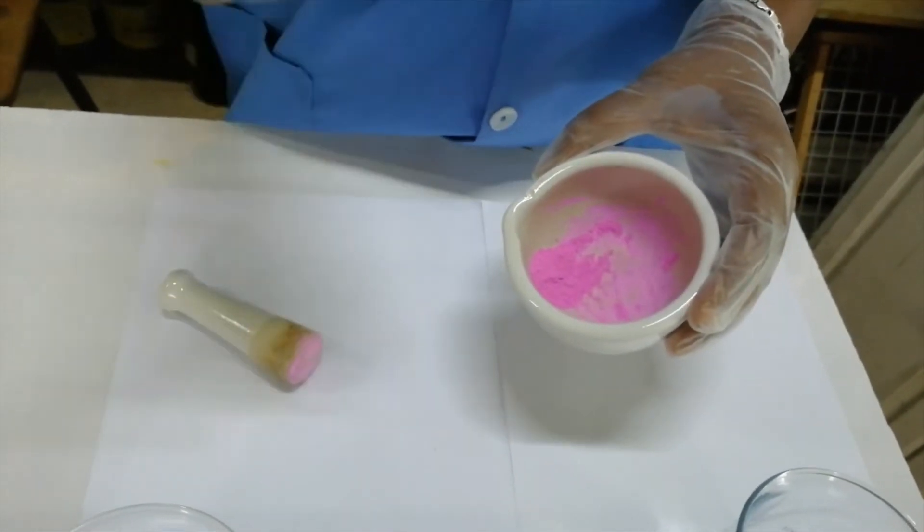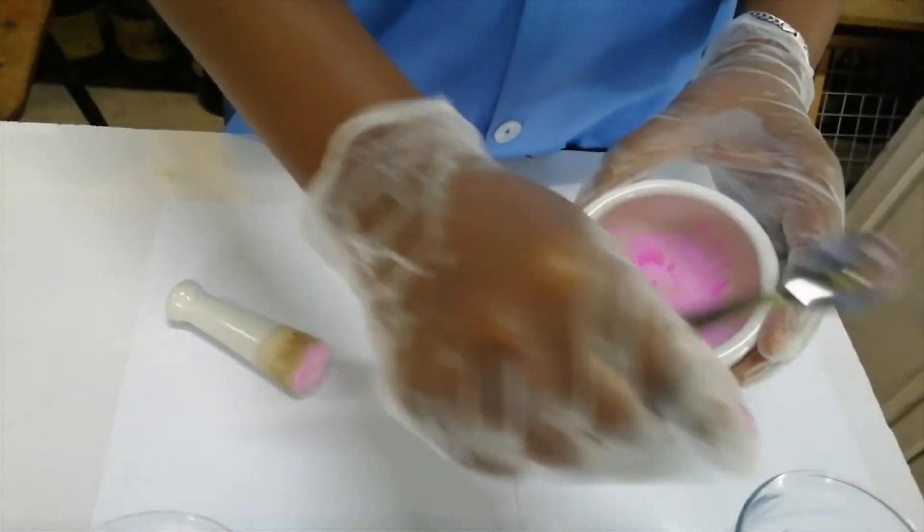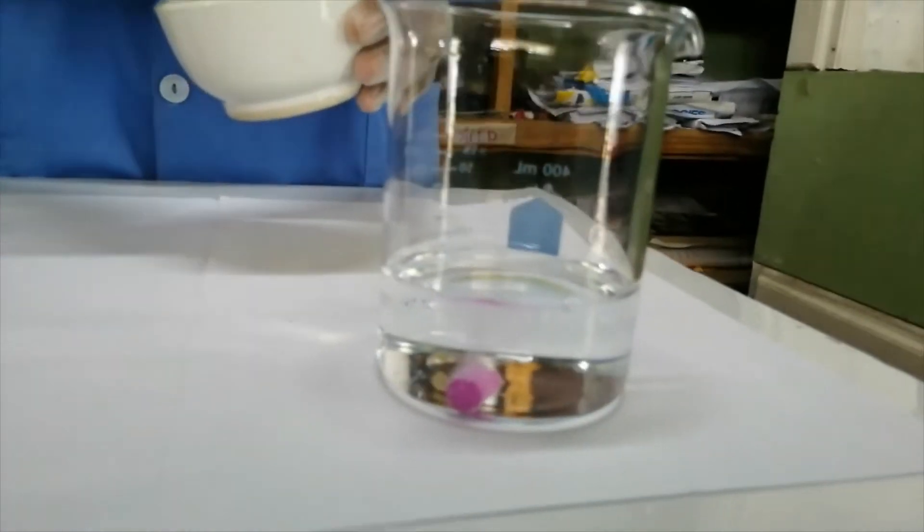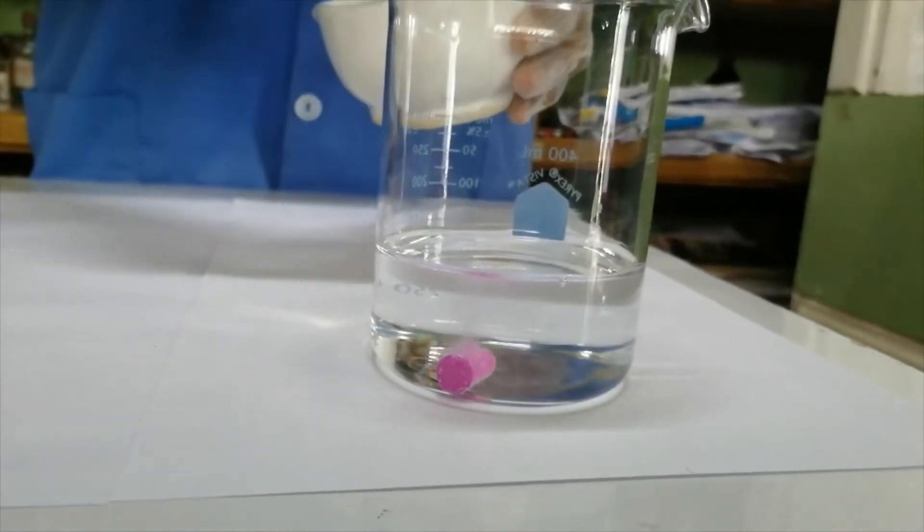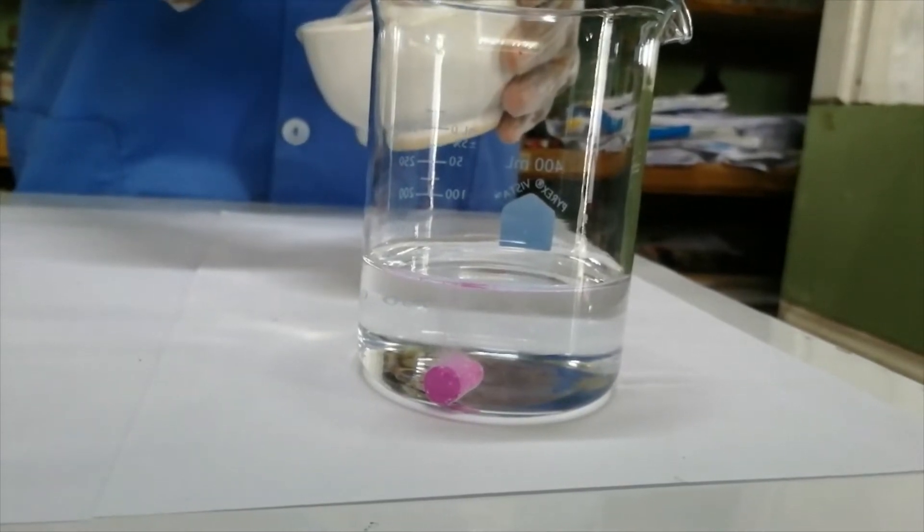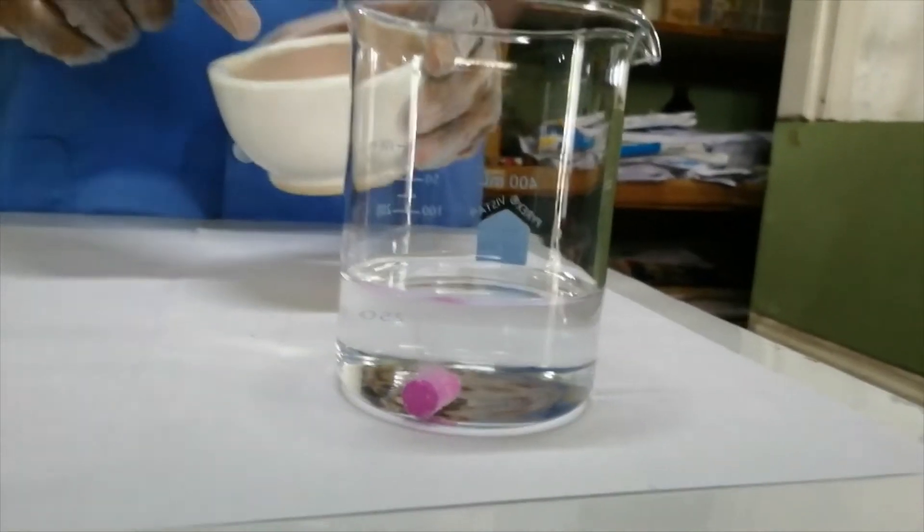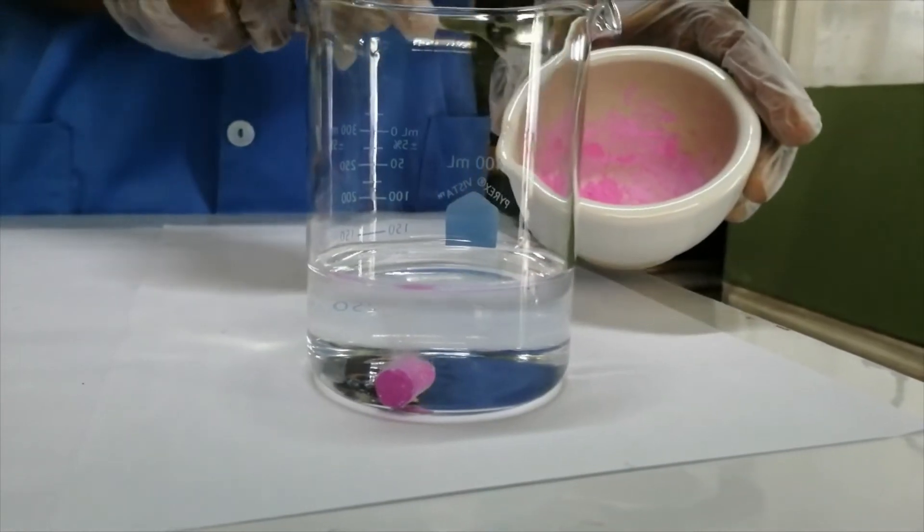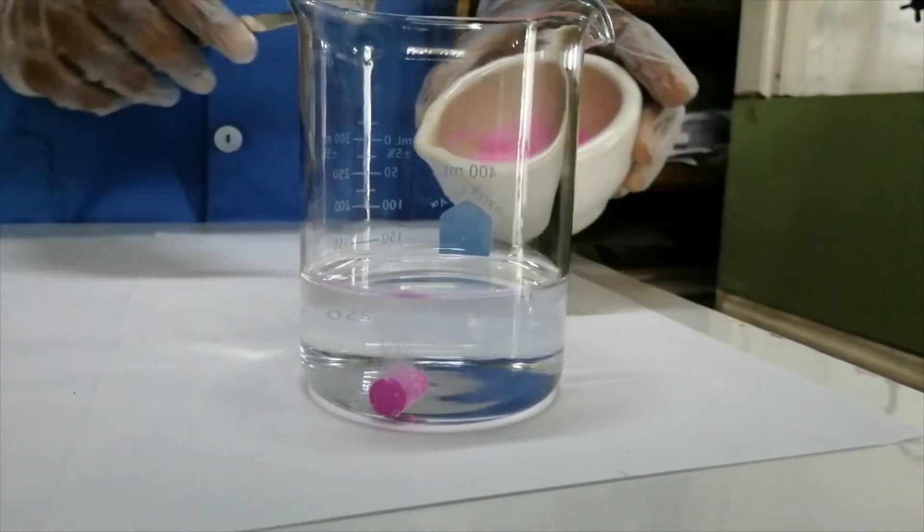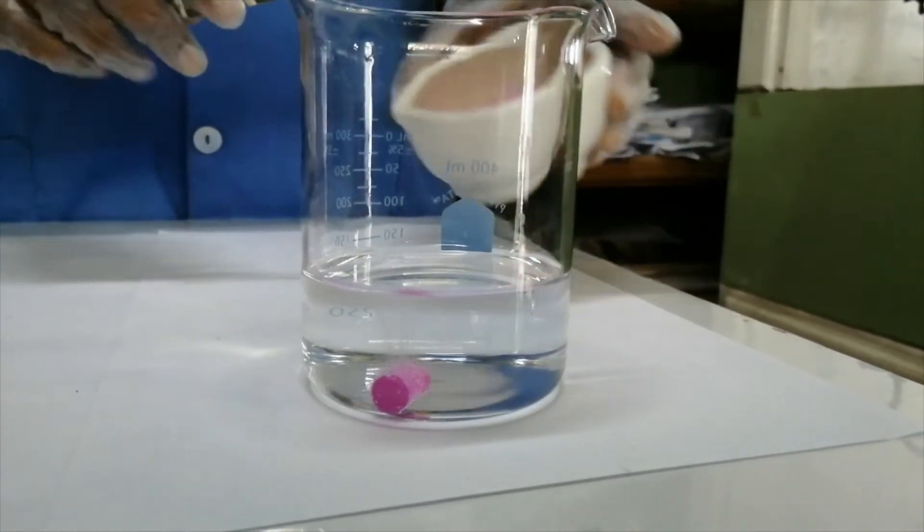Let me add this to the beaker so you can look at the reaction taking place. This piece of chalk has a larger volume and a very low surface area, whereas what's in this mortar has a very high surface area but a low volume.